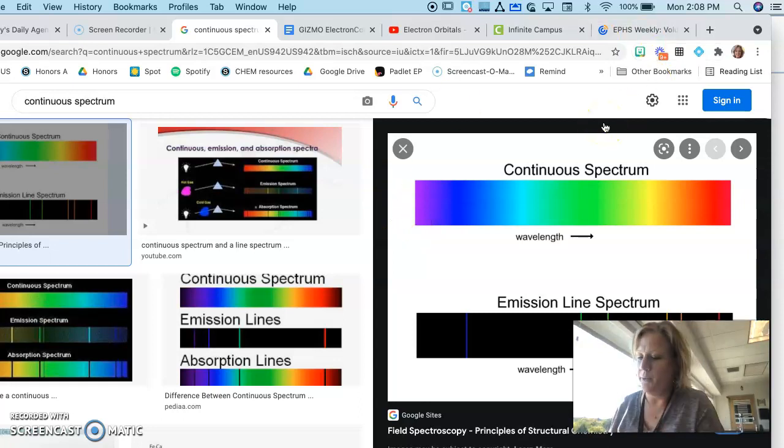Hi, this is a video that's going to help you to answer questions from the lab or activity that we called continuous and bright line spectrum. So if you missed that, one of the questions is about a continuous spectrum. So up here, this is what happens when you look through a spectroscope, which is kind of like a prism that breaks the colors apart.